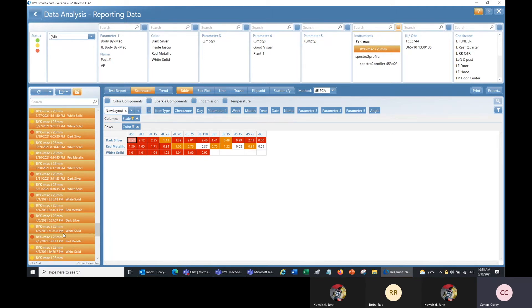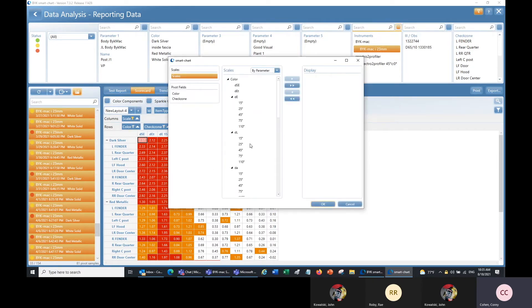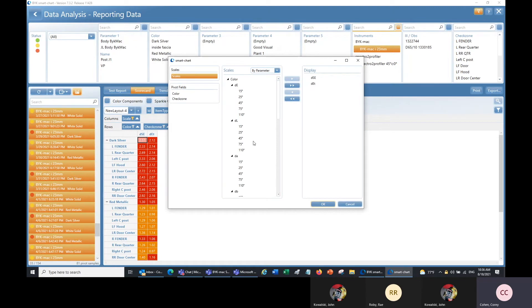I can change this pivot chart by dragging things either away or into these sections. For example, I can split up this data by check zone by dragging check zone into the rows column. So now instead of just seeing an overall average for each color — which would be sort of an executive report — I'm drilling down and seeing the measurements for each check zone. I can also click on scale to customize which scales are shown in this pivot chart, selecting only the ones I want, such as delta SE and delta ET.